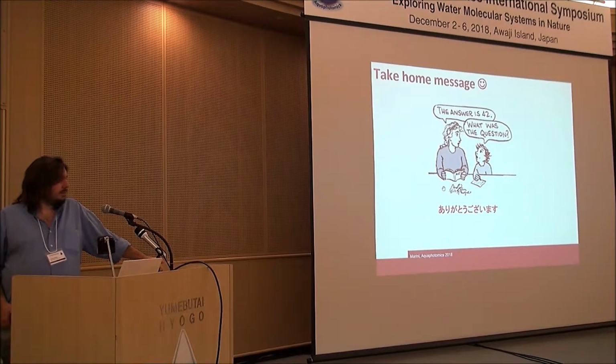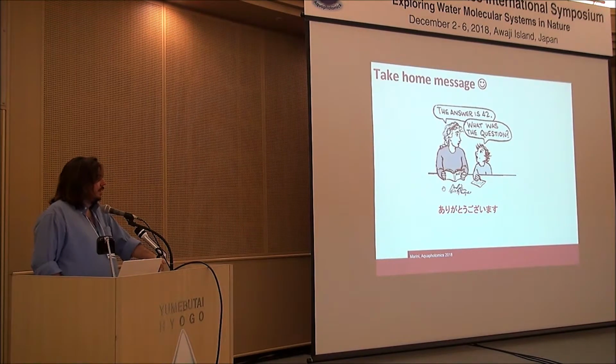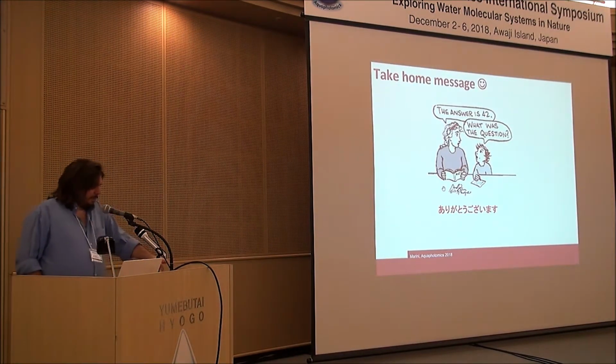For that discussion. Any question, comment? I have a question. Yes. About the MCR. Yes. How do you estimate the number of components in case of temperature dependence?